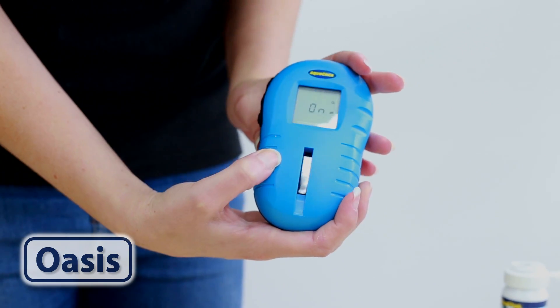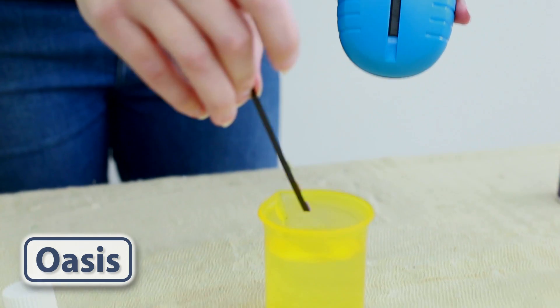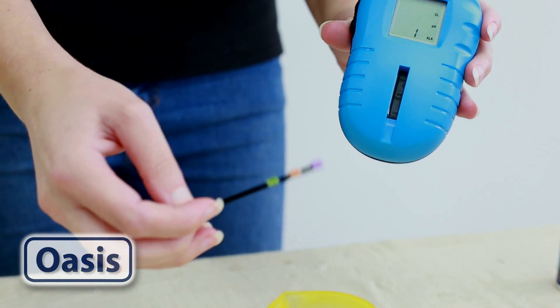Press the on button. When you're ready, press the bottom button on the side of the reader at the same time as dipping your test strip into your water sample.